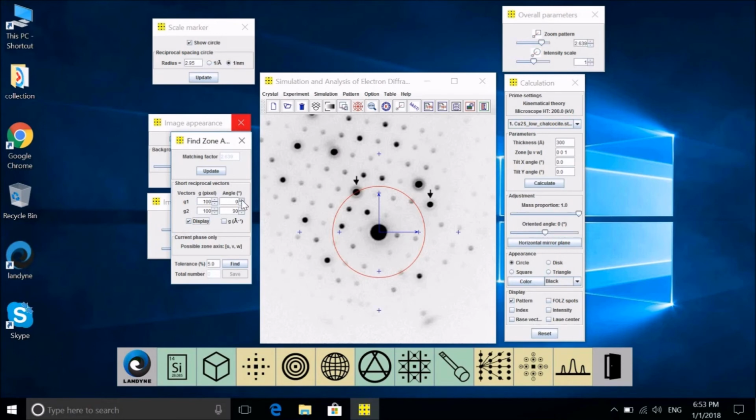Now first, the angle to this line, and we need to shrink the pattern. You can fill in a certain value directly here, and this is 88. You can fill in 44.